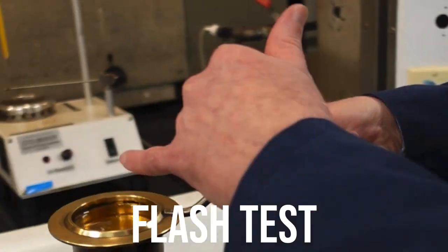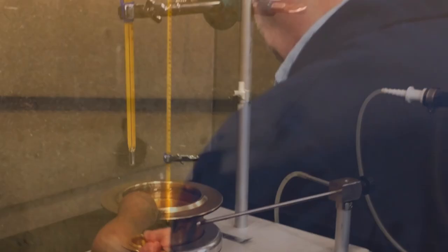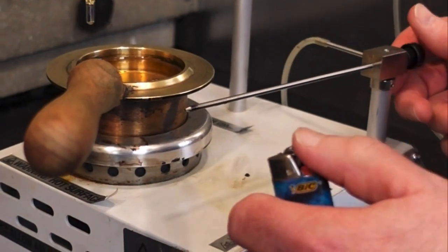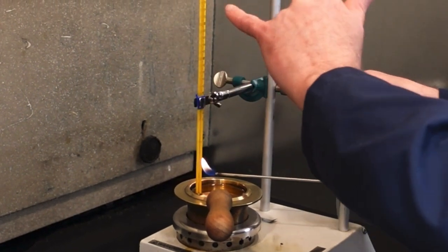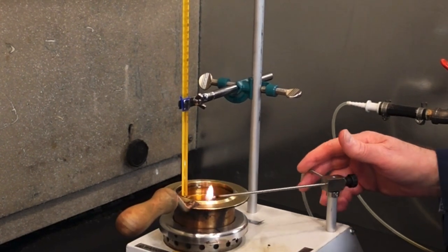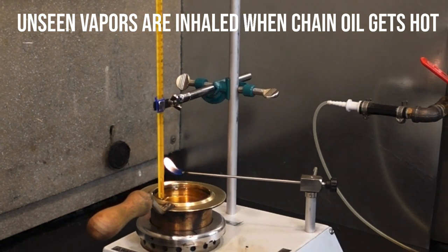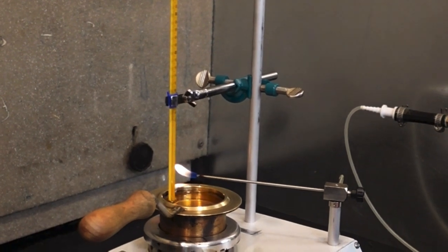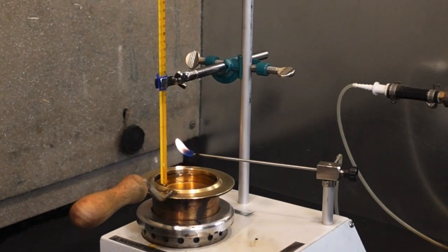So the cup is full to the line. There's a little indicator mark on there to show you how far to fill it. Right now what we want to do is to get this lit. What we're going to do is observe the temperature reading as it heats up. Right now, if you pass it over, nothing is going to flash because there's not enough vapors generated in the heating process. So we've got it turned on, and at this point we are just going to allow it to start warming and get itself up to temperature.